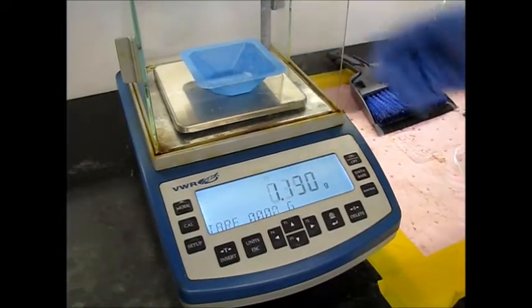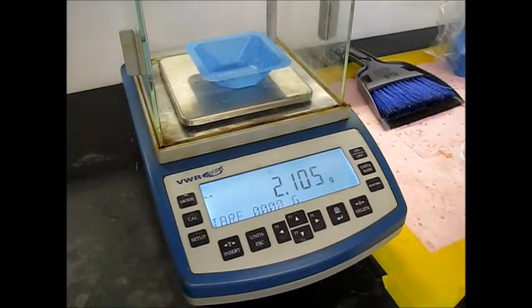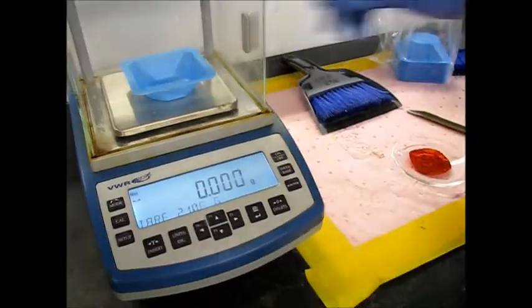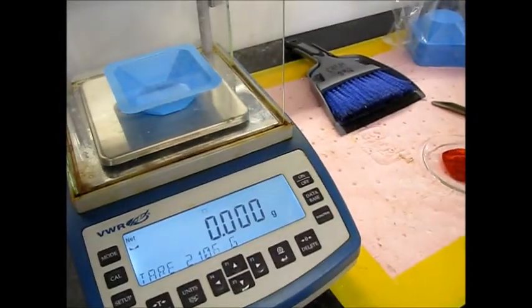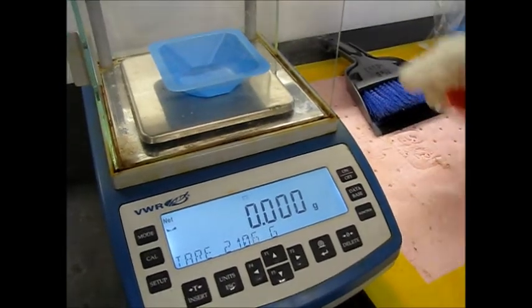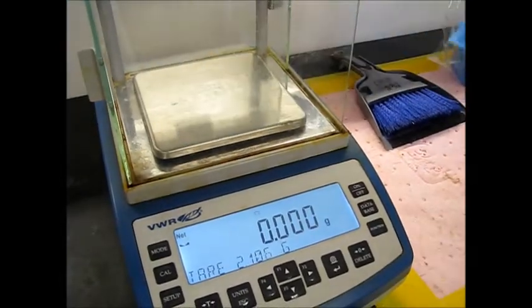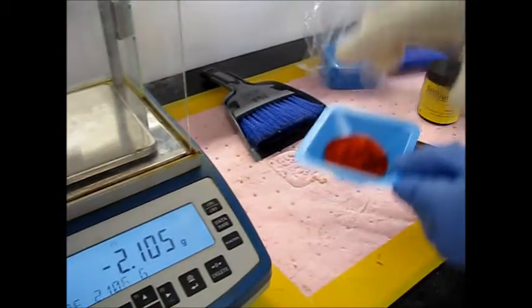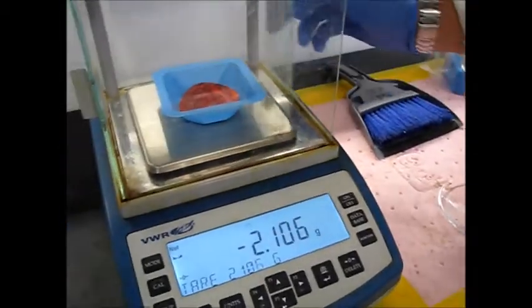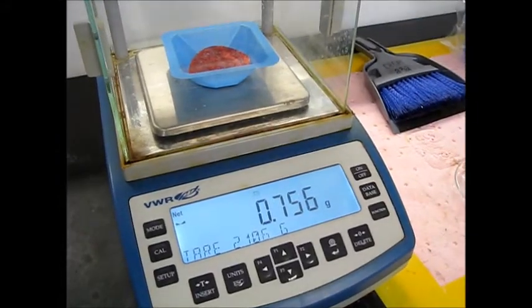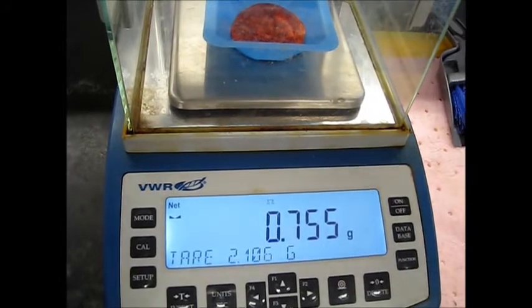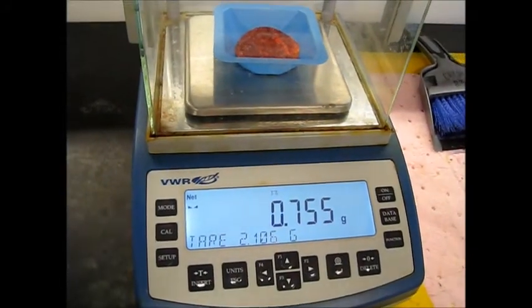So we just got it out of the oven. About to get the mass of our product. Add and tare there. 0.755. So we'll subtract the mass of our paper from that to get the mass of our product.